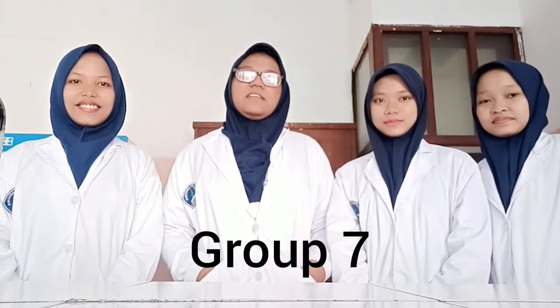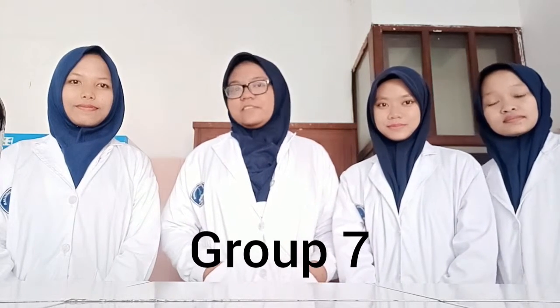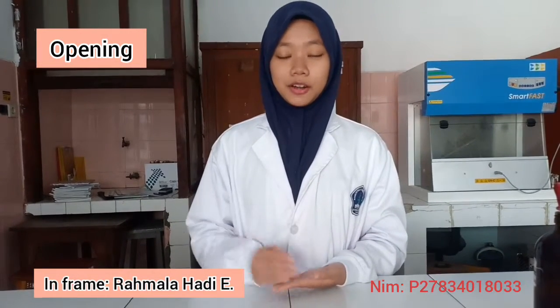Today we want to present how to do acid fast staining of bacteria. So let's get to the basics. Microorganisms which have a lot of lipid cannot easily be decolorized by acid alcohol. But if the microorganism is stained by a special stain like carbolfuchsin with a heating process, it will absorb the stain and cannot fade it. Acid fast staining consists of two methods.